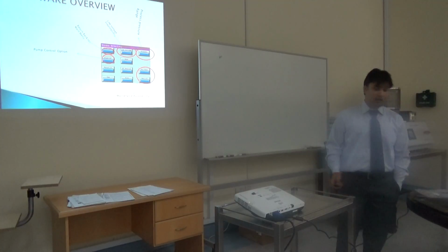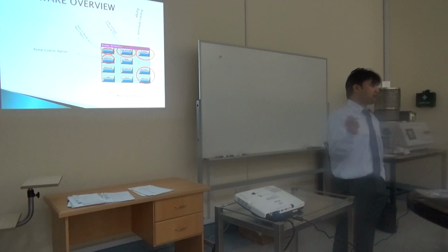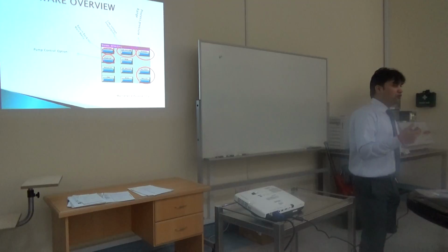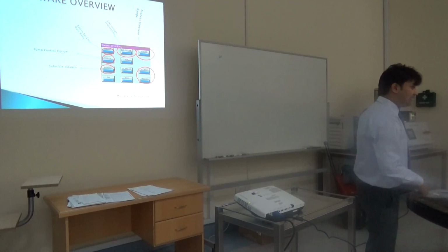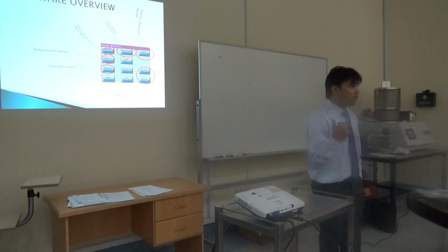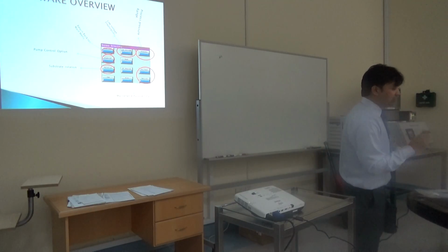Next, about the pump control options. If you touch this one, you will only access the pump condition, like which pump you want to turn on and what you want to do. You can access the pump condition also. Next, about the rotations. If you are discussing the substrate rotations, we know this is a very important parameter to rotate our substrate.